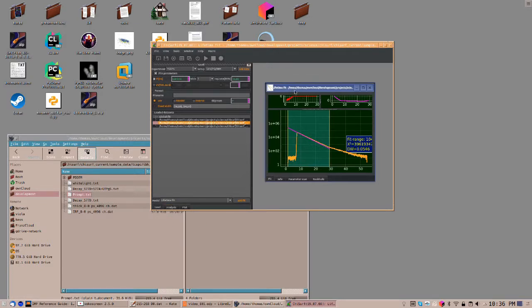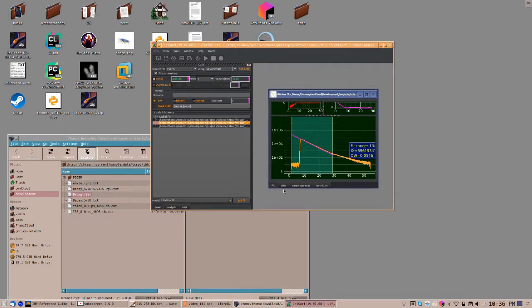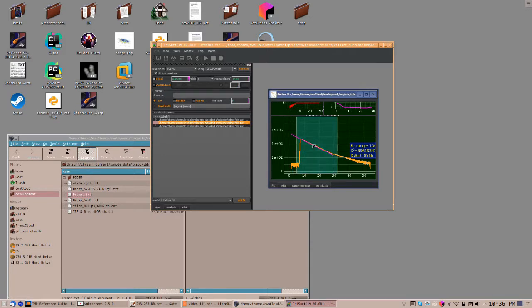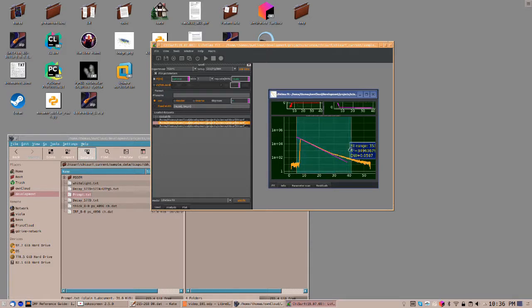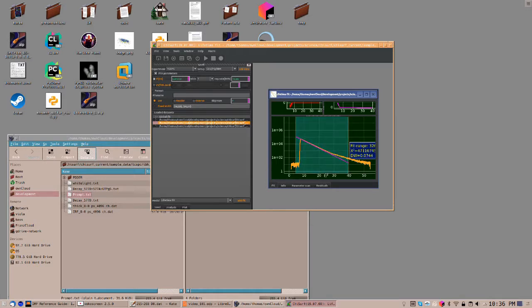In this window, different representations of your data and your analysis results are presented, the most important being the fit window. Here, you can specify the fit range with these sliders for your analysis.